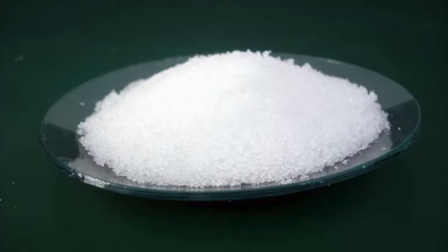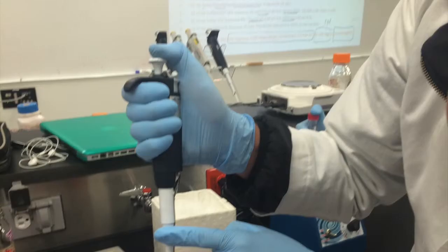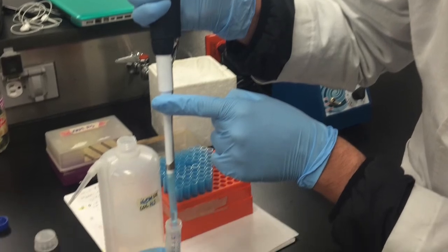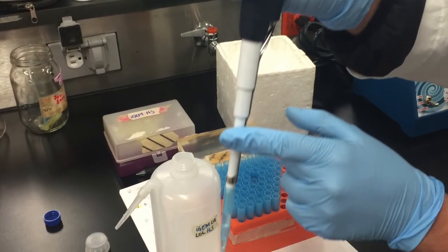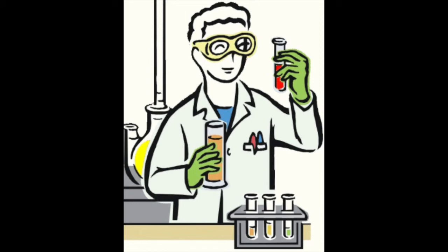Preparing laboratory solutions plays an important role in the correctness of an experiment. If the composition of a reagent is not correct, it often leads to errors in the observational results. While preparing a solution in a laboratory, the correct proportion of chemicals and solvents is crucial. Safety is also very important, as laboratories are highly prone to accidents. While using chemical reagents, one should be aware of correct handling, procedure, strength, and safety hazards.